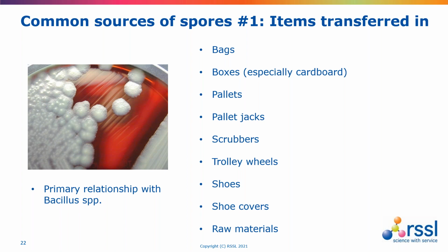Trolley wheels always stand up as the primary source of spores, and that's probably because, one, trolleys are pushed from room to room, and there are even activities where instead of items being transferred from one trolley to another, trolleys are sometimes pushed between different grades of clean rooms, or even to CNC areas and back again for, say, rubbish disposal. And trolley wheels are very hard to disinfect. If a trolley is large, it's not easy to lift it up and wipe the wheels, for example.